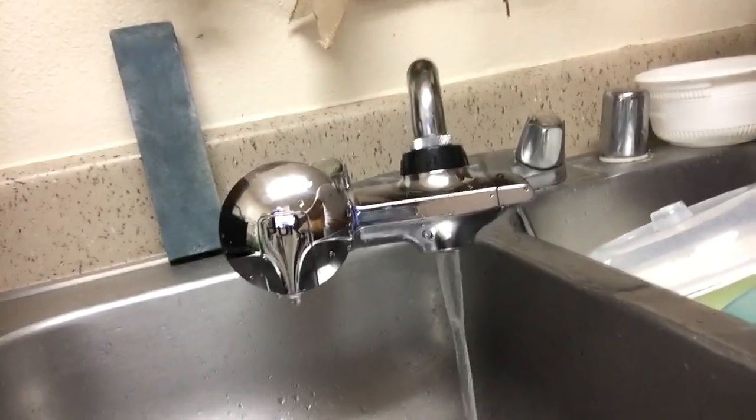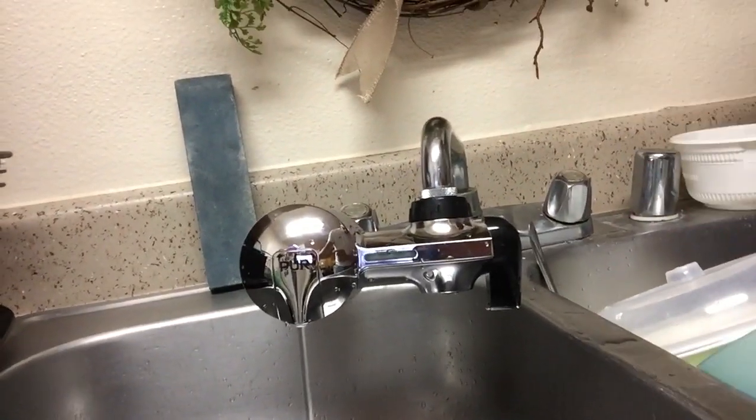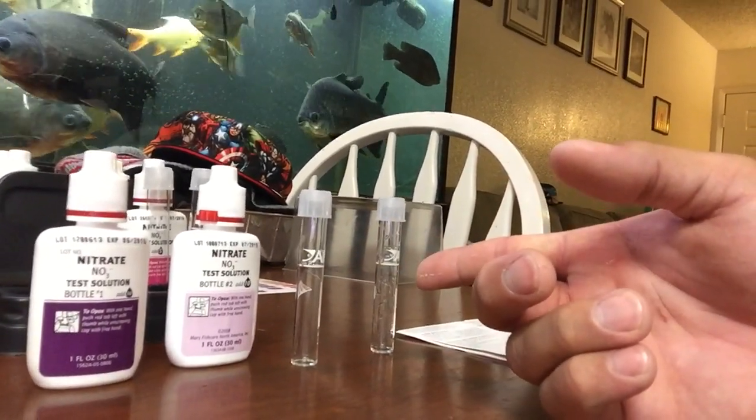How are you doing guys? Just gonna do a water test. I just bought the PUR water filter that attaches to your faucet and I've been running it for five minutes already so it should be ready. I'm just gonna test for nitrate. I have my water test kit here — two vials, one straight from the tap and one will be through the filter.